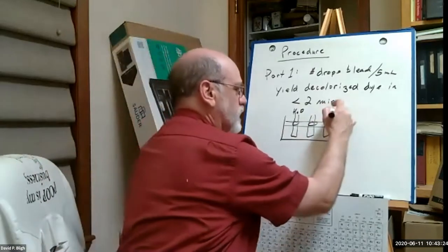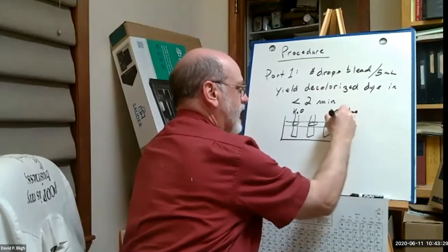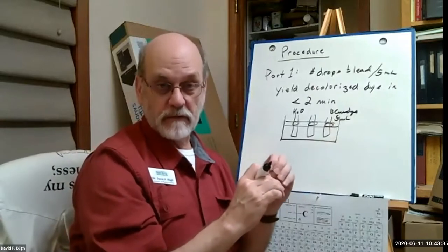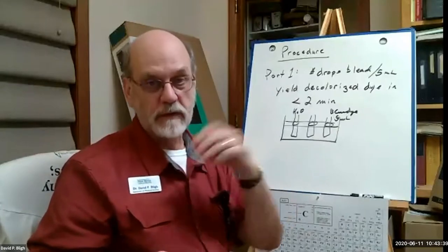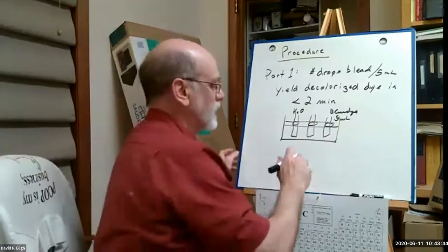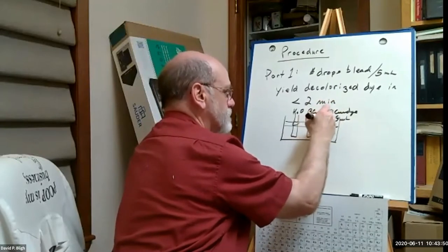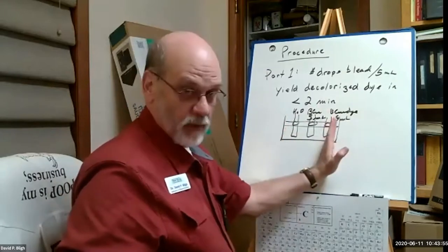And then you have one over here with your blue dye, 5 milliliters exactly. So you use your volumetric pipette, and we learned how to use volumetric pipettes in Gen Chem 1. And you need also a blue dye here, 5 milliliters. Okay? You're going to leave that one alone. You're going to leave that one alone.